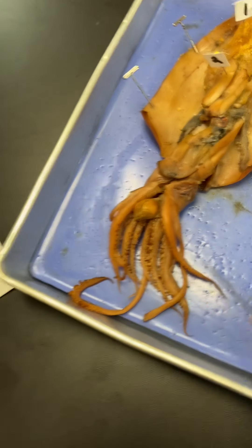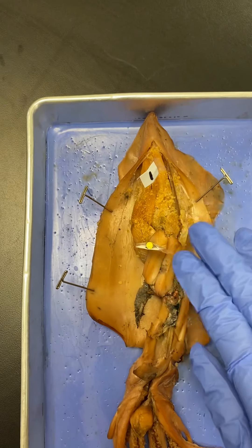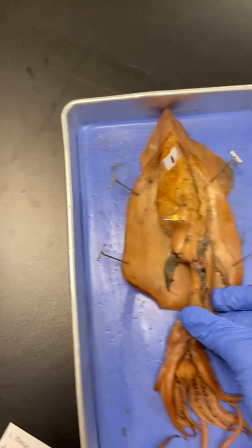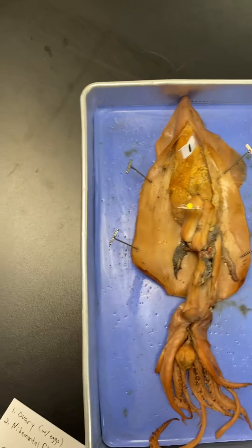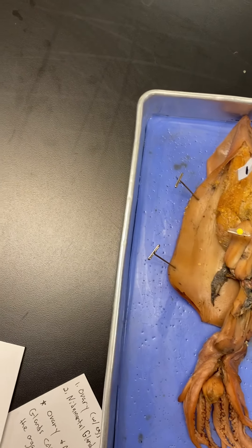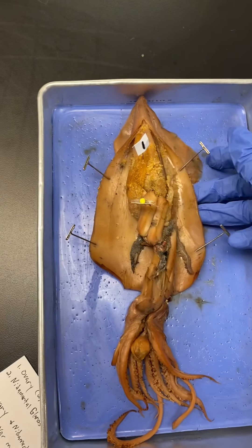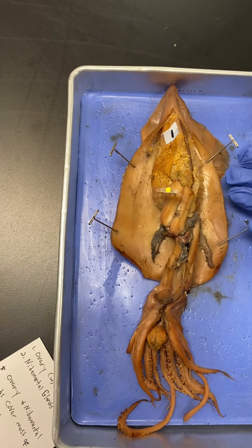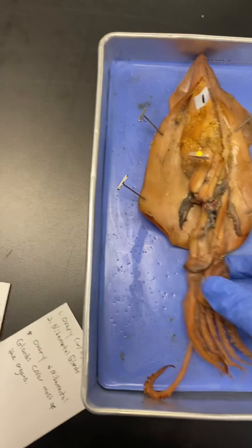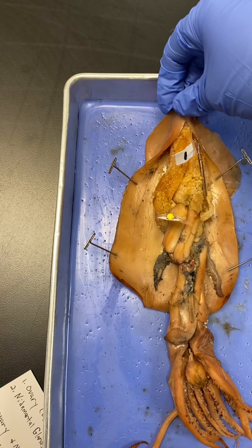You can see the gills, you can see the siphon, the eye — which has a hard lens inside — then the buccal mass which has the beak and mouth. You can see the pen underneath right there, which is reduced from that of a shell. And then you have the mantle, arms — the short ones — and tentacles with the suckers.